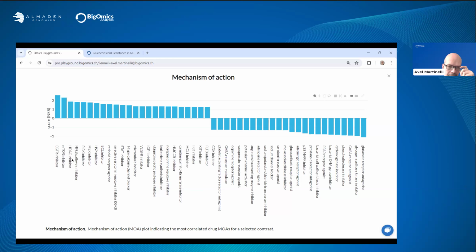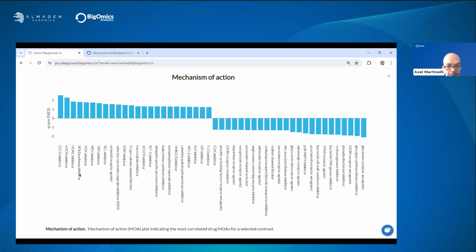And you can see, for example, here, when we look at mTOR inhibition, that's one of the properties of cucurbitacin. This is also related to the proteasome inhibition, and you can see PI3K, obviously mTOR and PI3K are correlated. Cucurbitacin in traditional Ayurvedic medicine is used as an anti-inflammatory molecule, which is captured by its properties as an NF-κB pathway inhibitor.